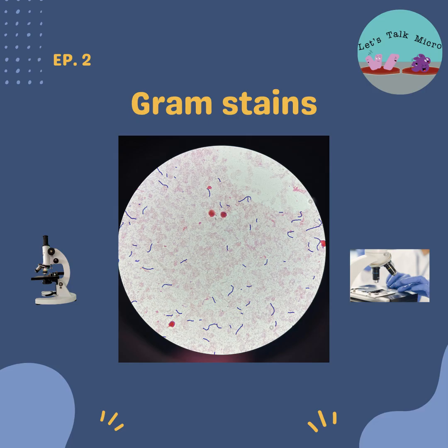And then, of course, you know about cerebrospinal fluid, CSF. We prepare the smear the same way, we cytocentrifuge it. And all this time I've been saying gram stains, gram stains, gram stains. What is a gram stain?